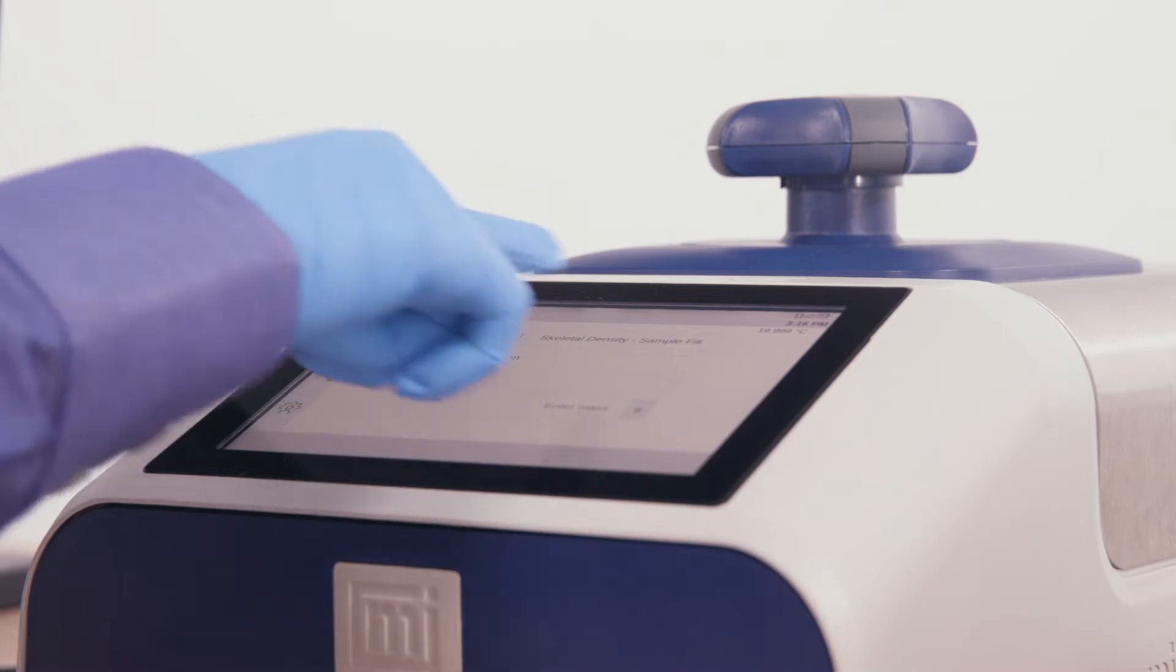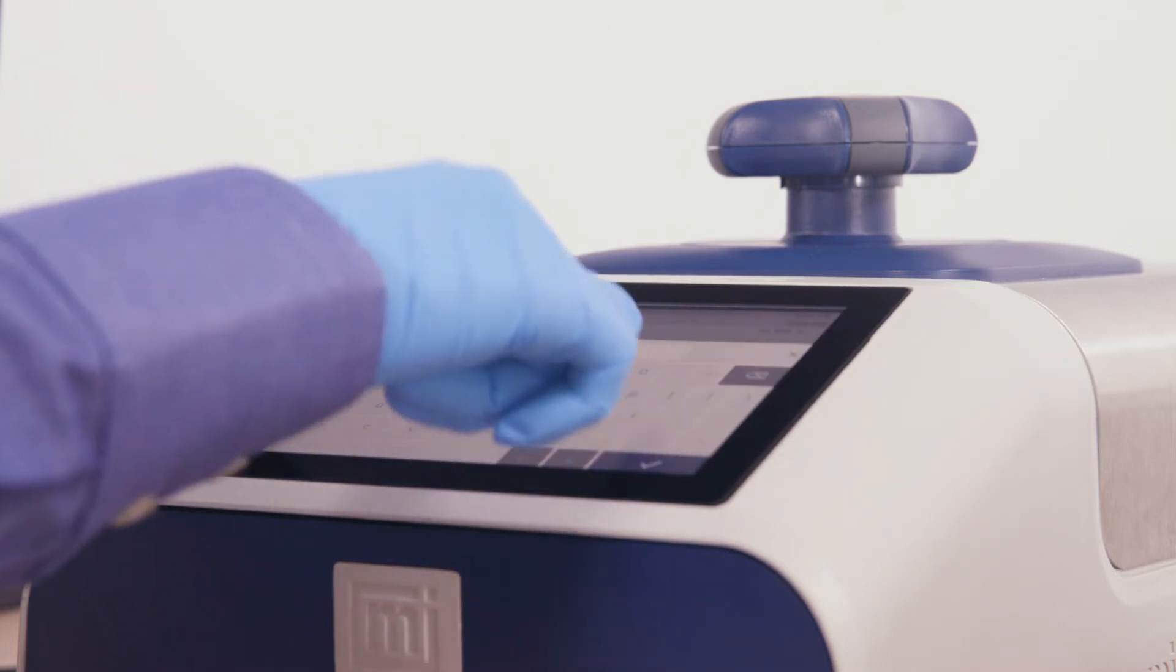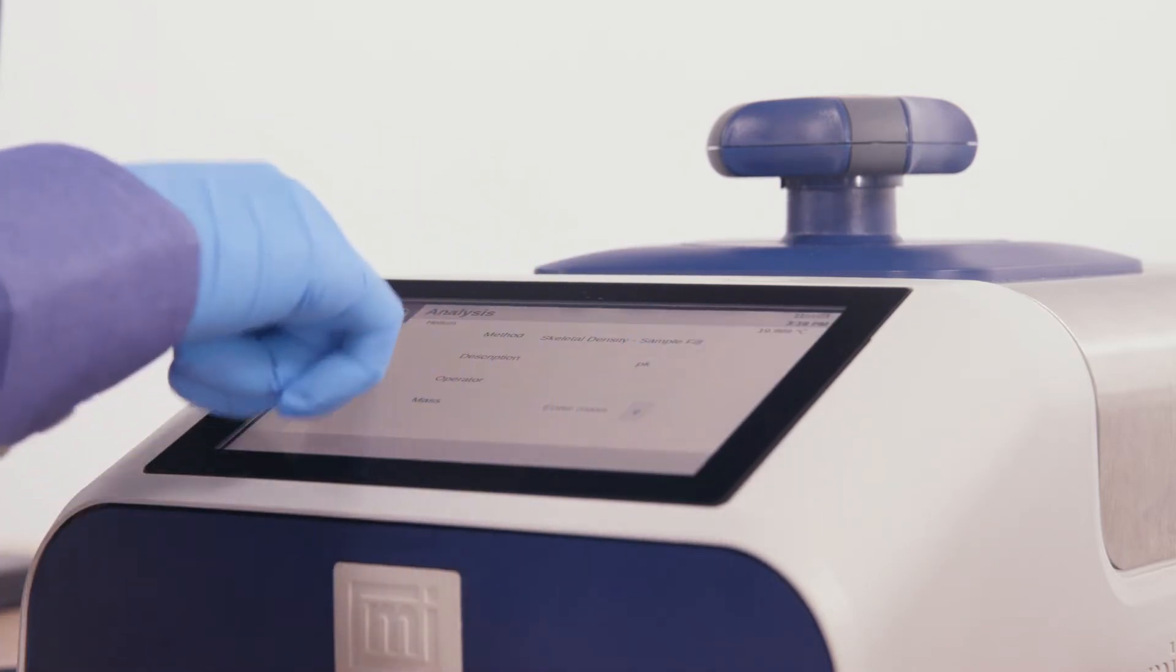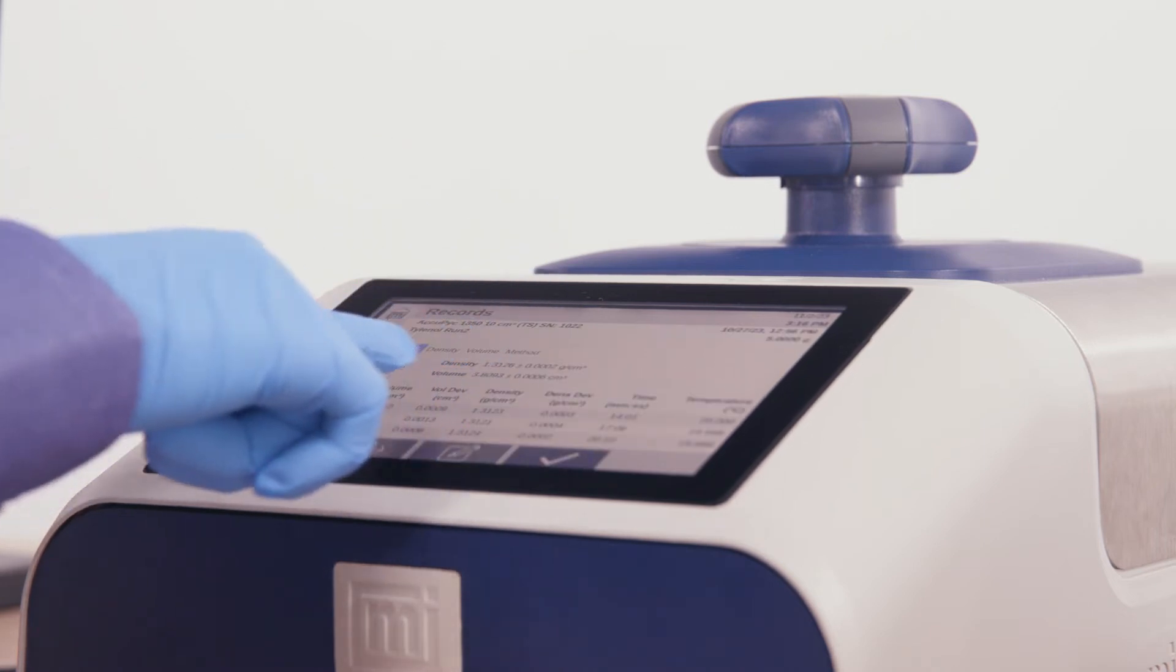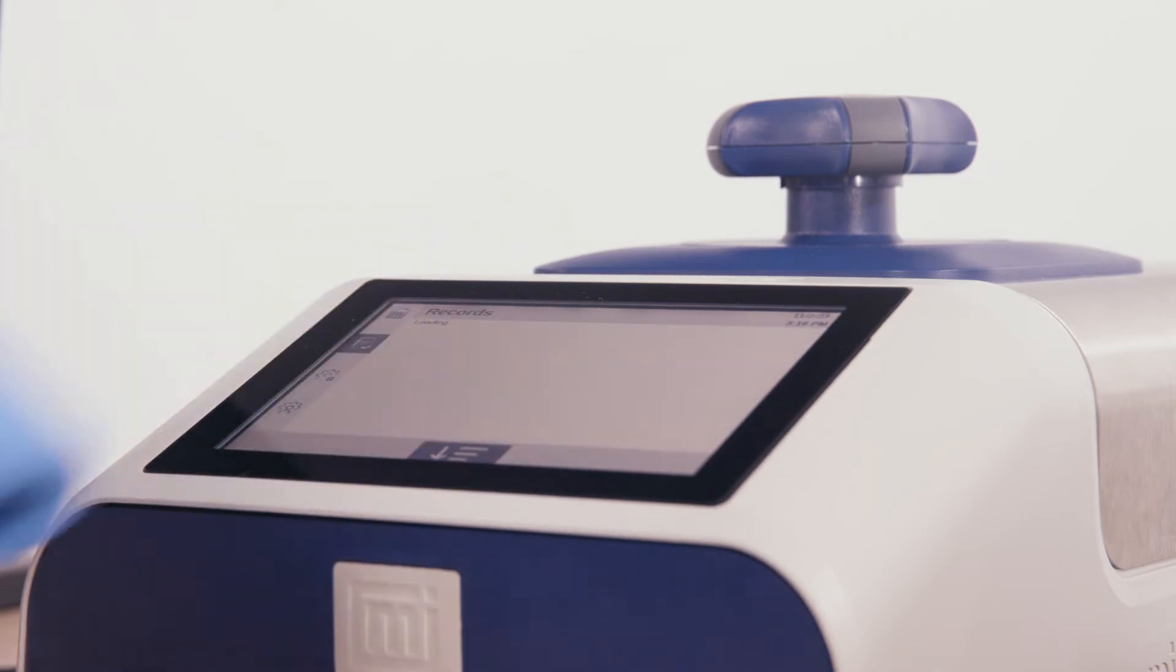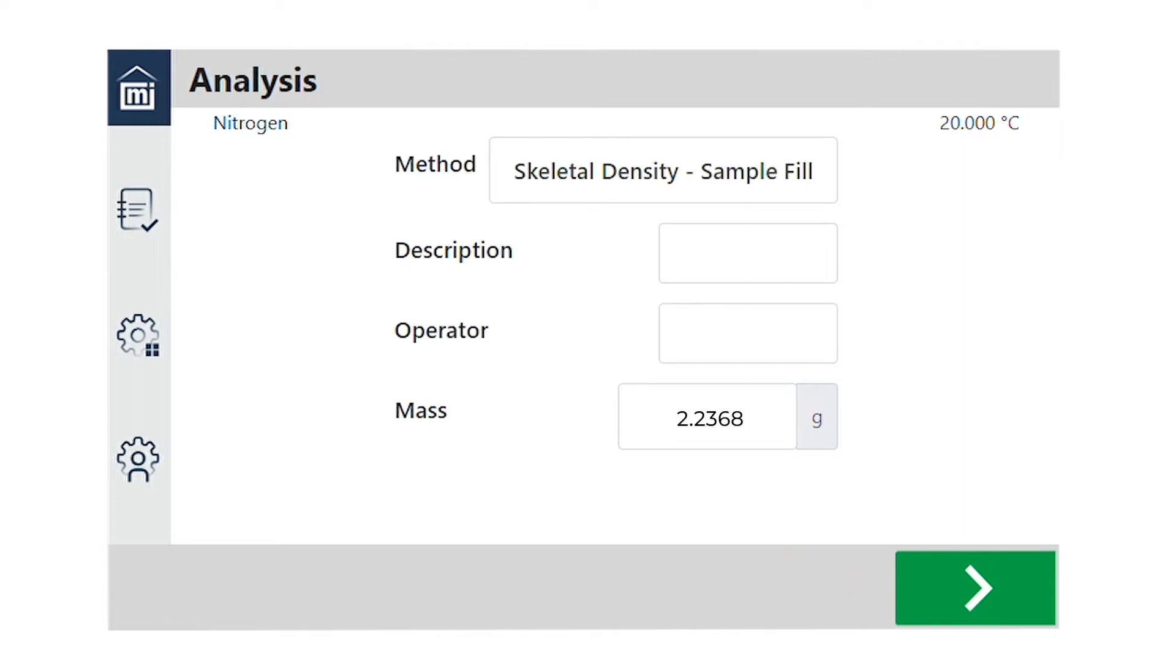To operate the AccuPIC, the instrument has an intuitive Breeze touchscreen interface which can be used to run tests, manage results, and everything in between. The instrument can also be connected and controlled through a computer. Let's go ahead and start this analysis.